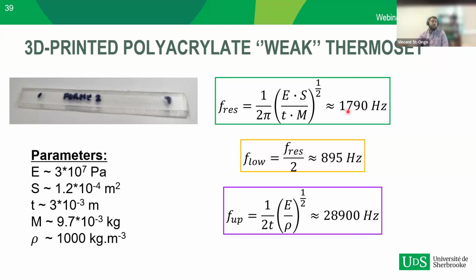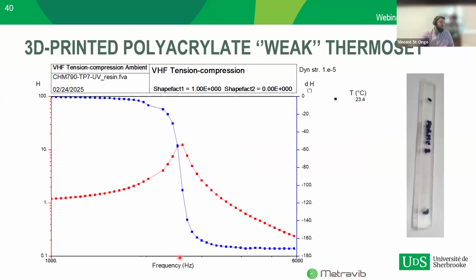So here, in terms of the resonating frequency, we would have expected 1,800, and we can see when we measure it that we're closer to 3,000. So there's a bit of a shift happening here with this thermoset, but we could still manage to do the measurement after a bit of tweaking on the mass that we added on top of it.